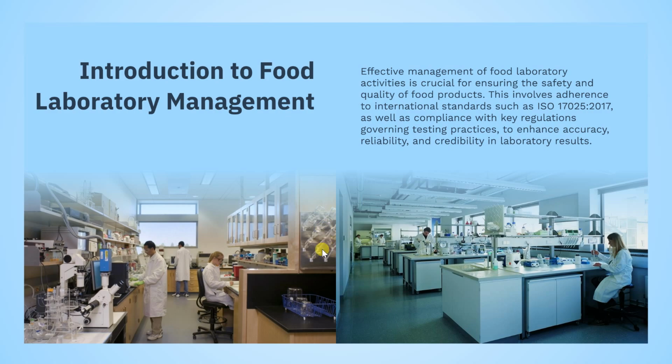You see the rack for test tubes or bottles, where you can place your bottles or test tubes, and after cleaning your test tubes, you see the cupboard where you keep your glassware. And from the right side, these people are conducting different tests in food testing laboratories.